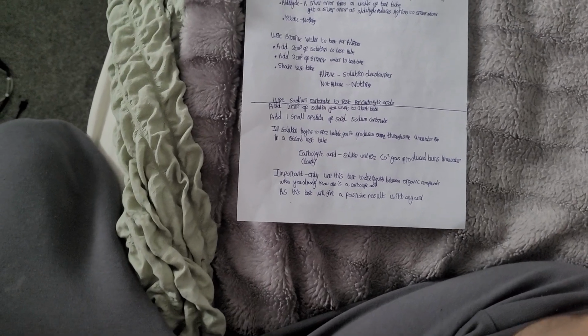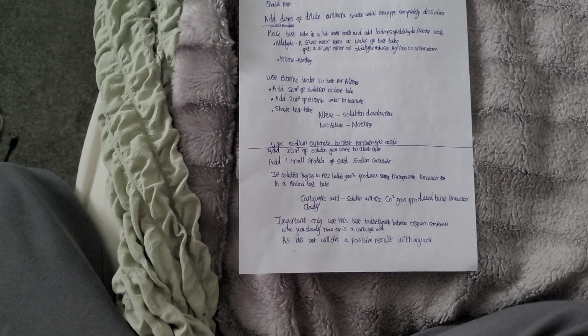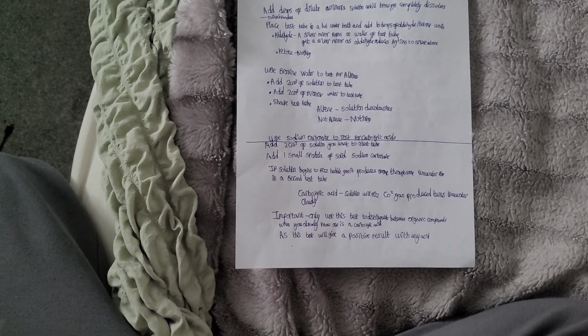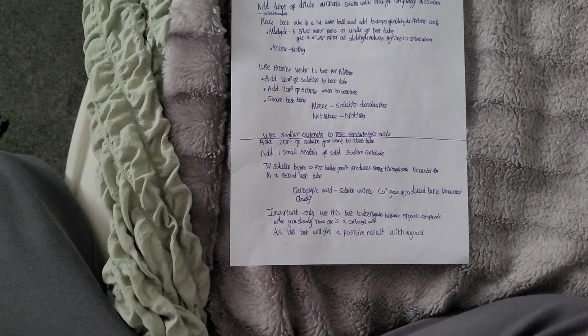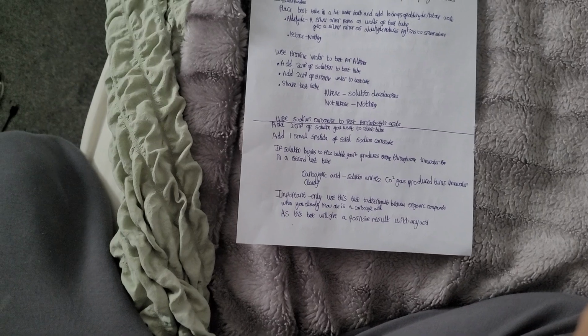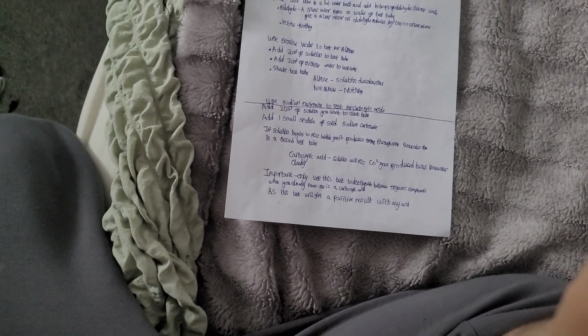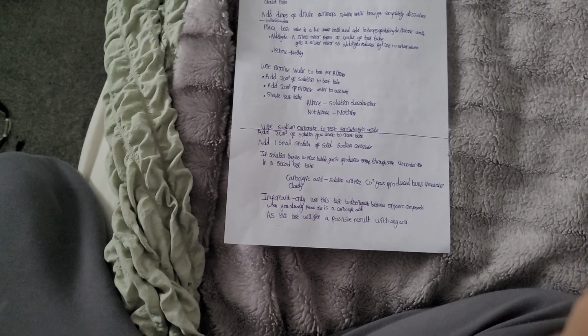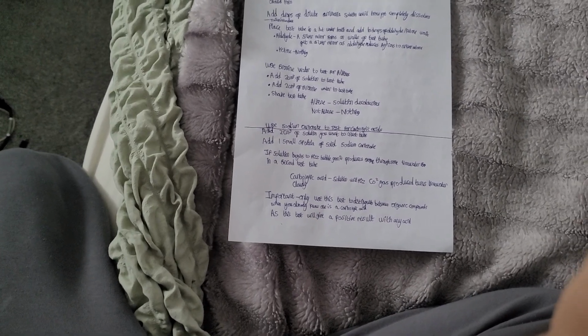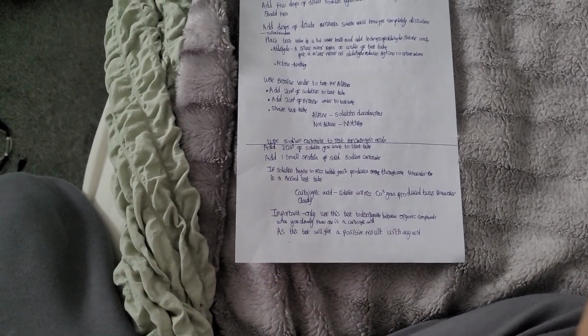Something very important though: you can only use this test to distinguish between organic compounds when you already know one is a carboxylic acid, because this test will always give a positive result with any acid. So you need to make sure that one of them is a carboxylic acid.